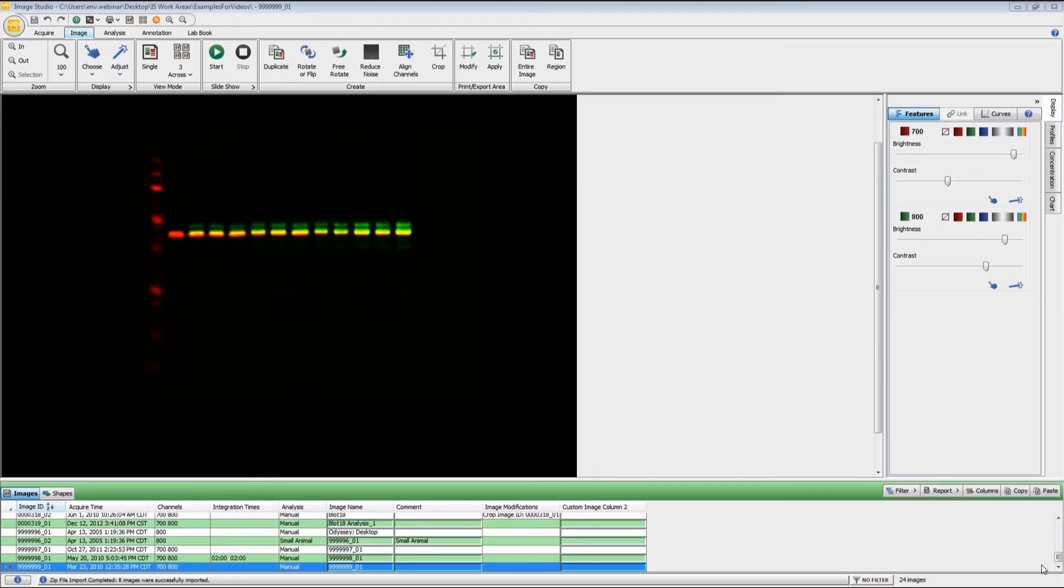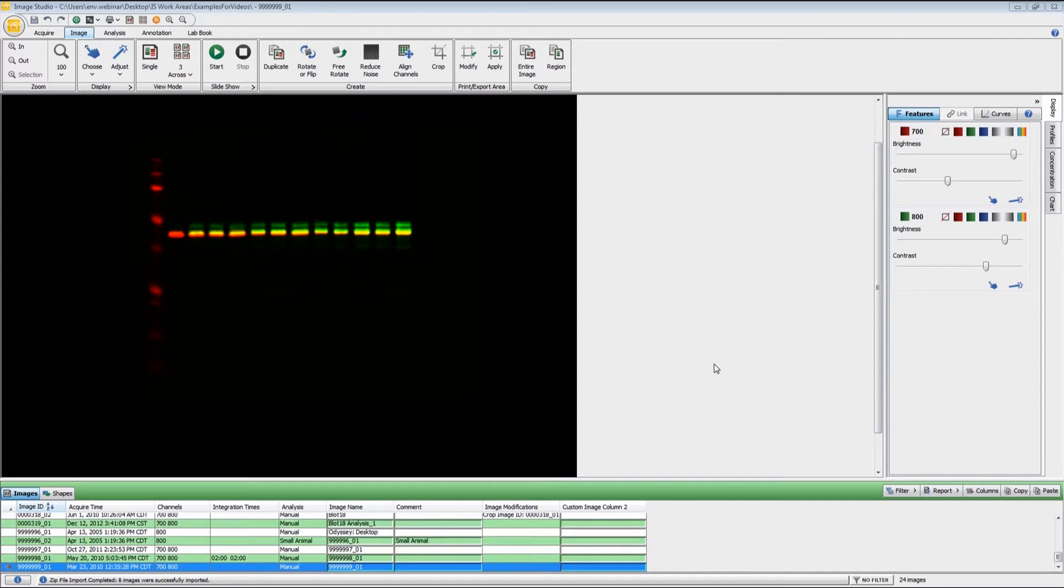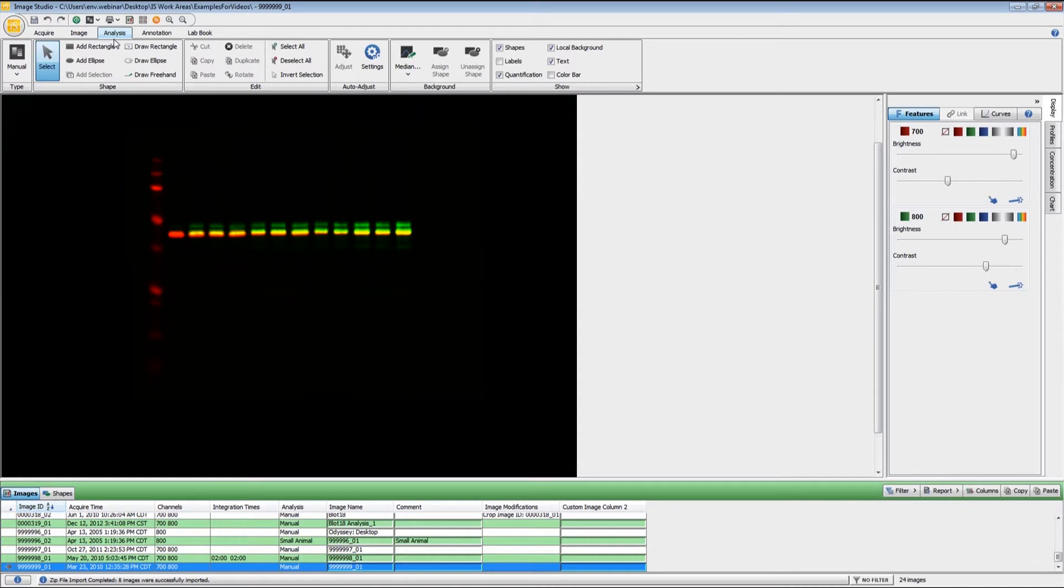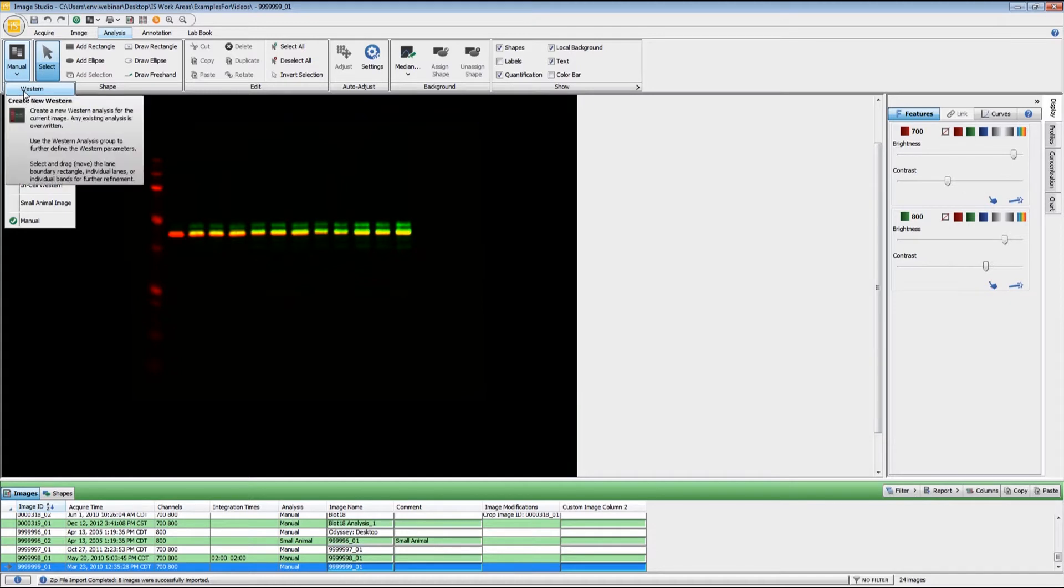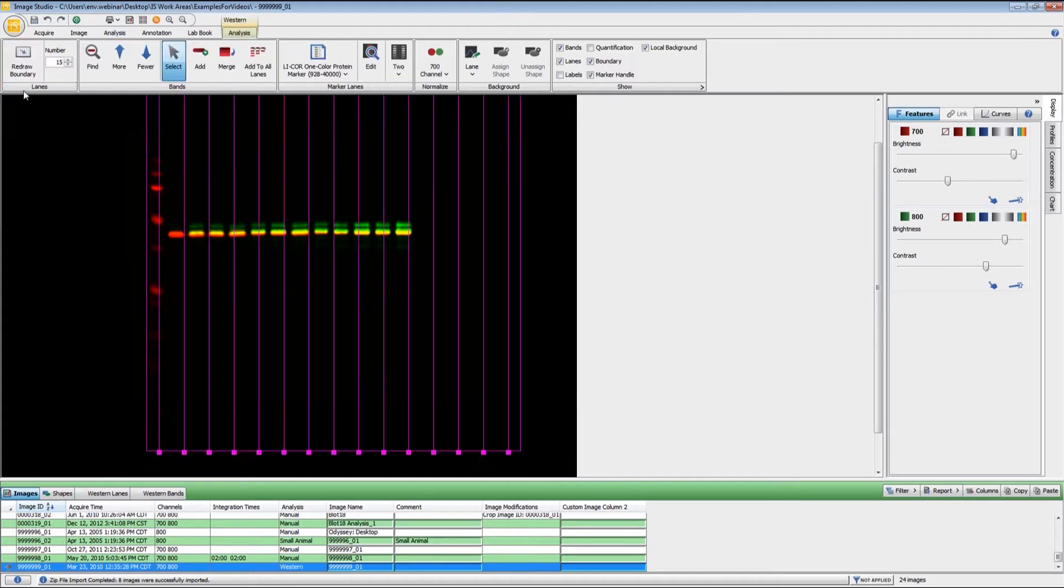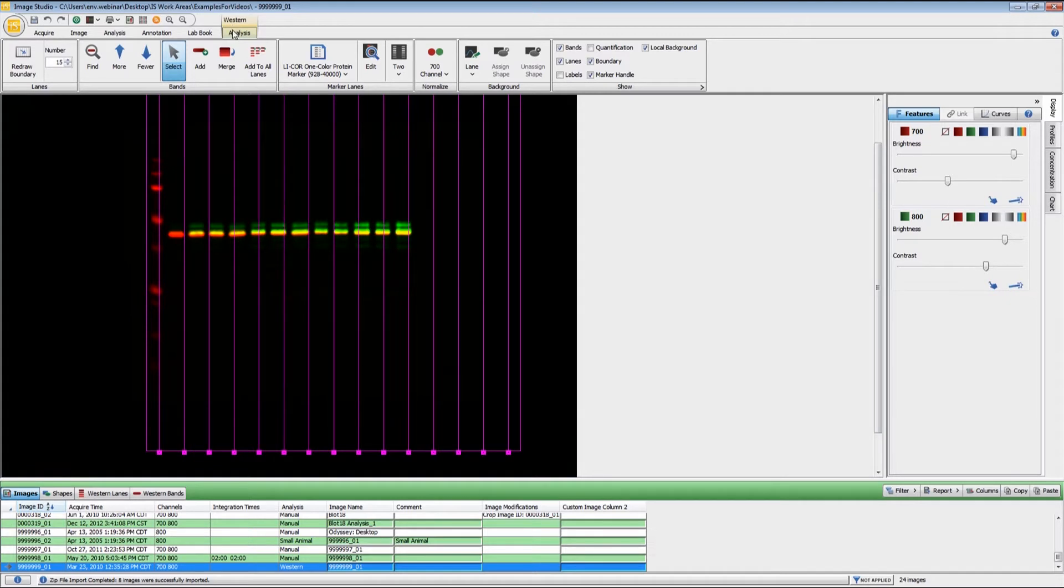In this video, I'll be taking you through the steps involved with analyzing an image using the Western Analysis Ribbon. If during acquisition you did not apply the Western Analysis, you need to come to the Analysis Ribbon and under Type, click on this and choose Western. Once that has been applied, you will notice that there is a new ribbon that opens up here just to the right of LabBook.